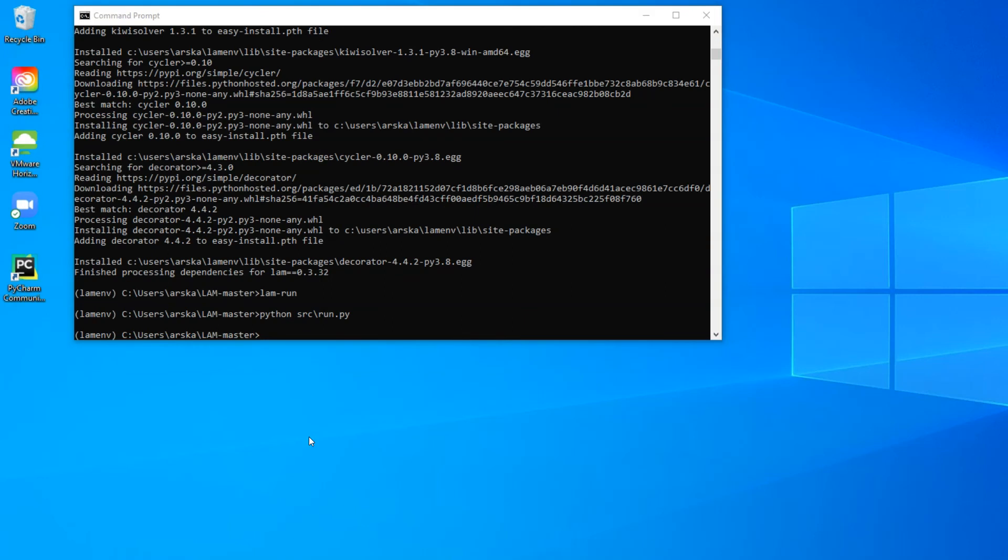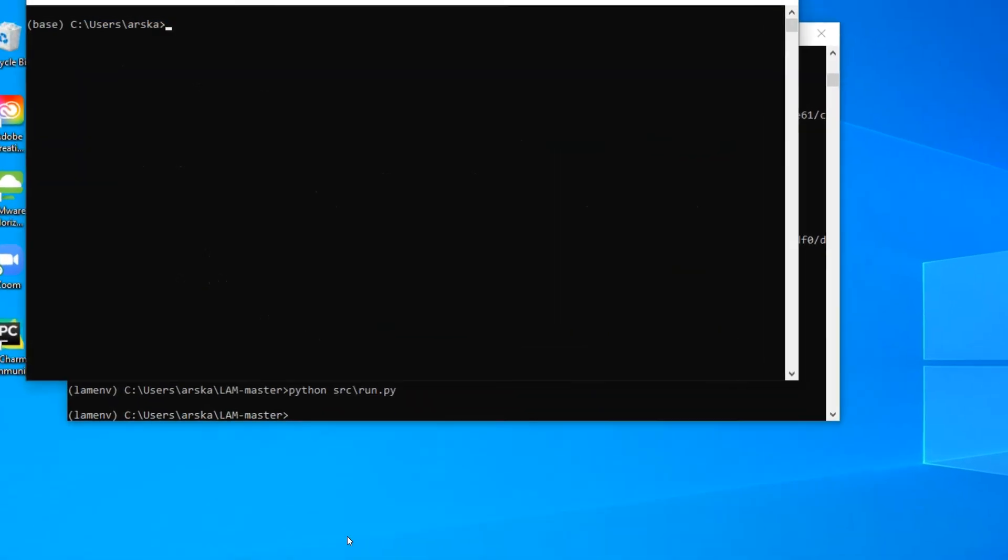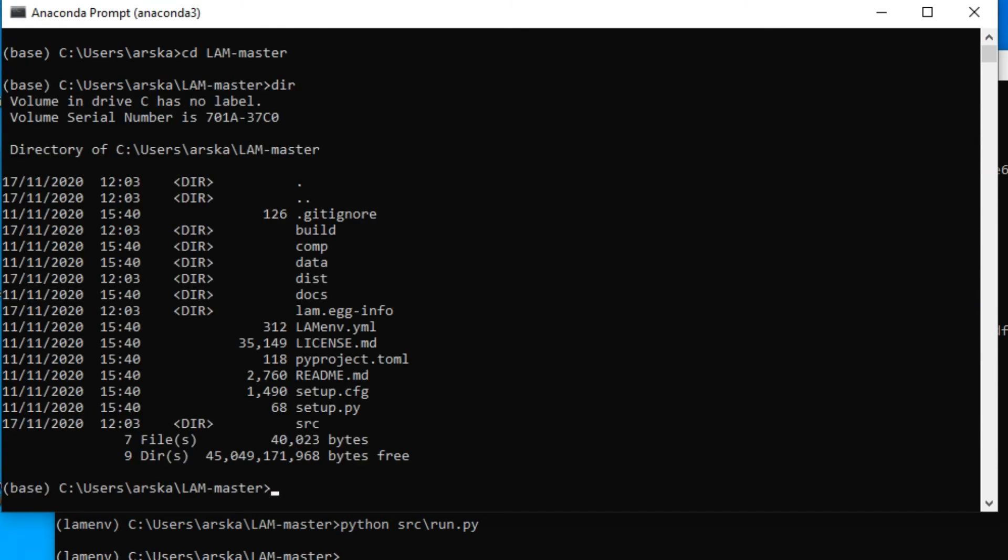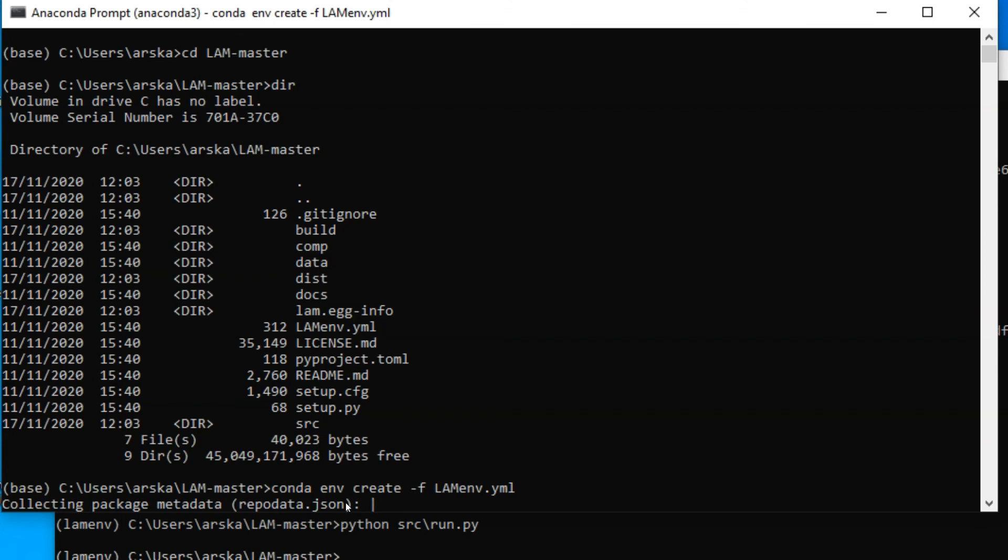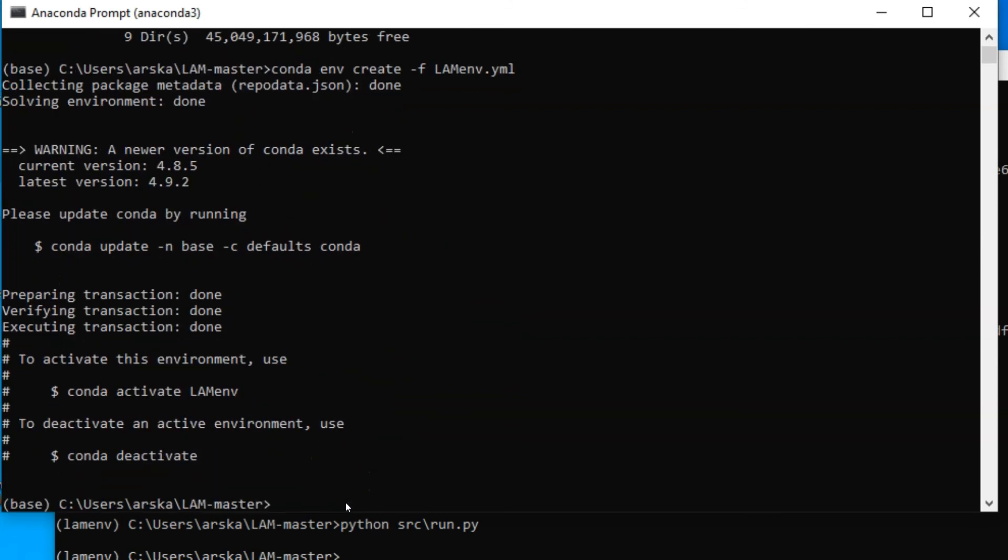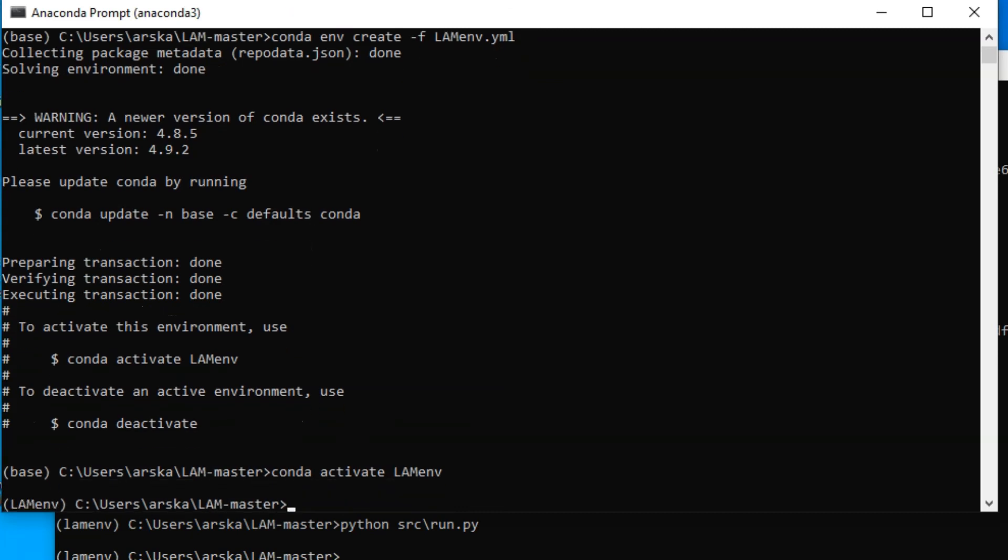If using Anaconda distribution, you can create a Conda environment using the LAM ENV.yml in LAM master folder by giving command conda env create -f LAM_ENV.yml in Anaconda prompt. Activate the environment with conda activate LAM_ENV and then install LAM as before with the command python setup.py install.